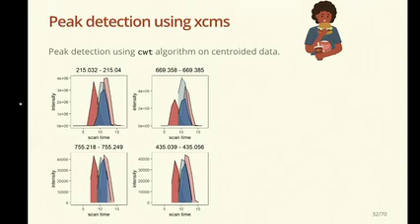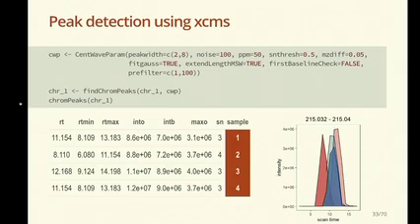So if you then do the effective peak picking itself, just some code to demonstrate, but it's not that important. If you do it in XCMS, you get a table which then characterizes the mass peaks in its retention time. Retention time, of course, being then the scan time, but it's not really relevant in an ambient sphere, intensities, and then in which samples it's detected.